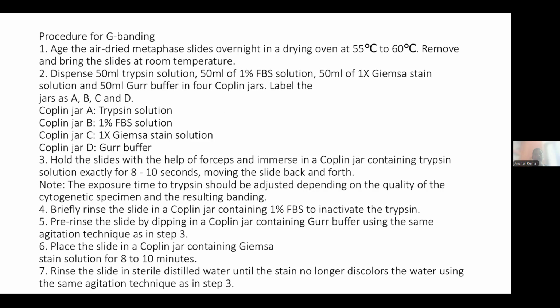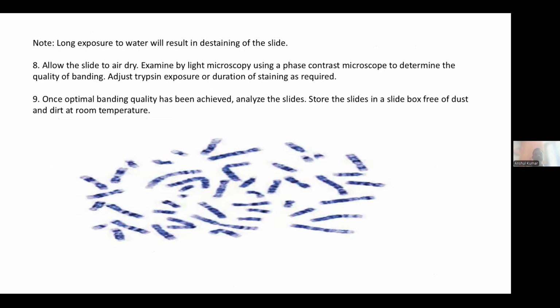Rinse the slide in sterile distilled water until the stain no longer comes out, and then remove the slide. Long exposure to water will result in de-staining the slide.